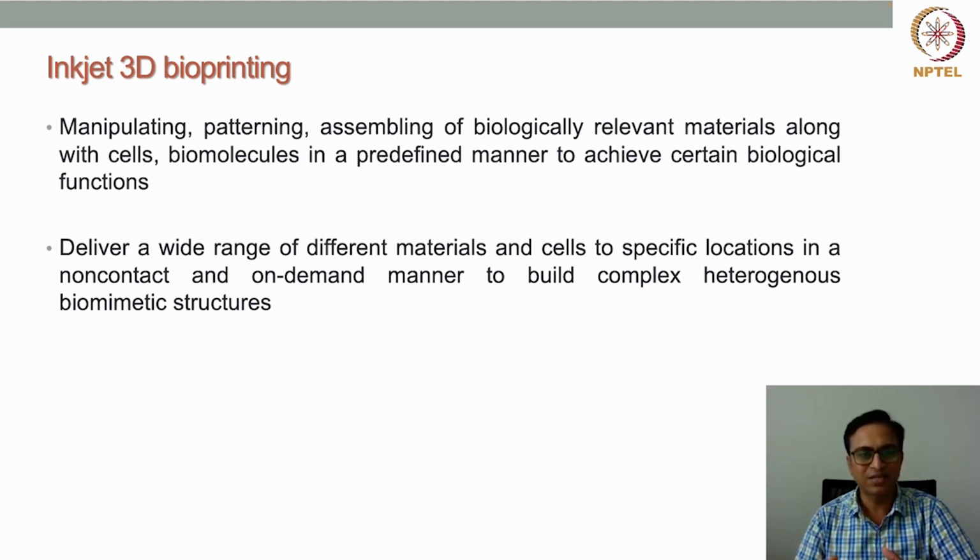So for all this, inkjet 3D bioprinting is very much used to develop this kind of three dimensional tissue or organ structure.